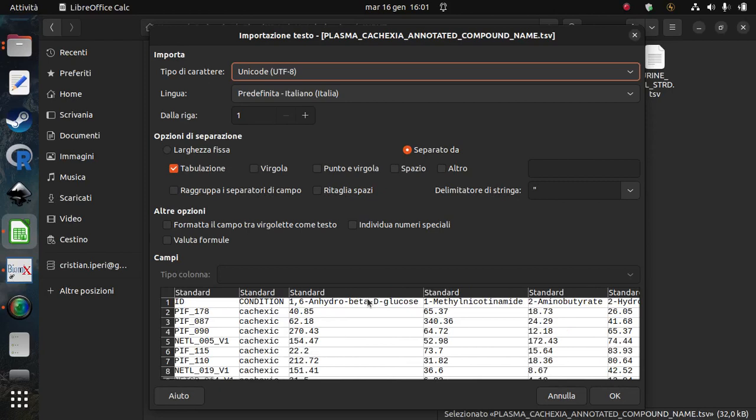The format that is asked for in BiomiX is always the same, and it includes the name of the sample in the columns and the name of the variable in the rows, and there should not be any column called condition. That is a situation that the majority of you can actually meet in reality, and that's why BiomiX has been made to solve this type of problem.